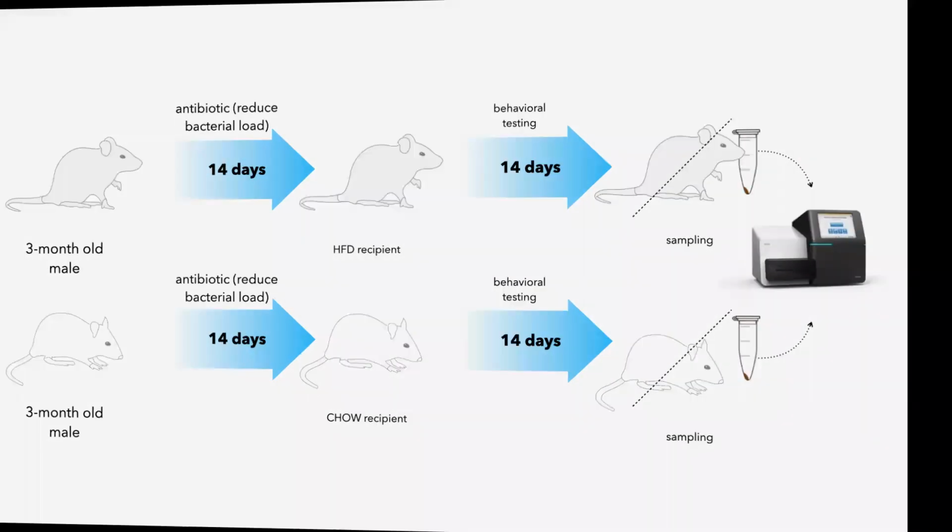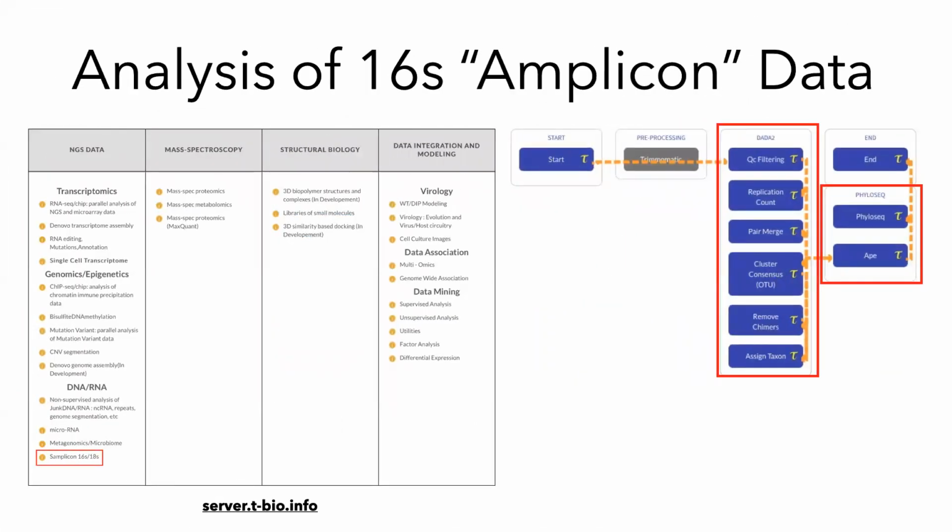So now let's actually do the analysis. We're not going to actually run the analysis. We're just going to look at a demo right now, but all of this is described in metagenomics too. So if you want to reproduce this analysis and see where these files are and what the sequencing files are, you can find them in metagenomics too.